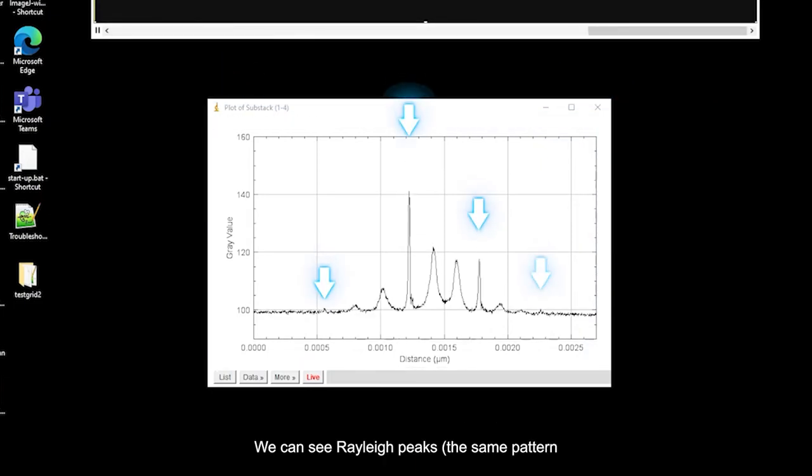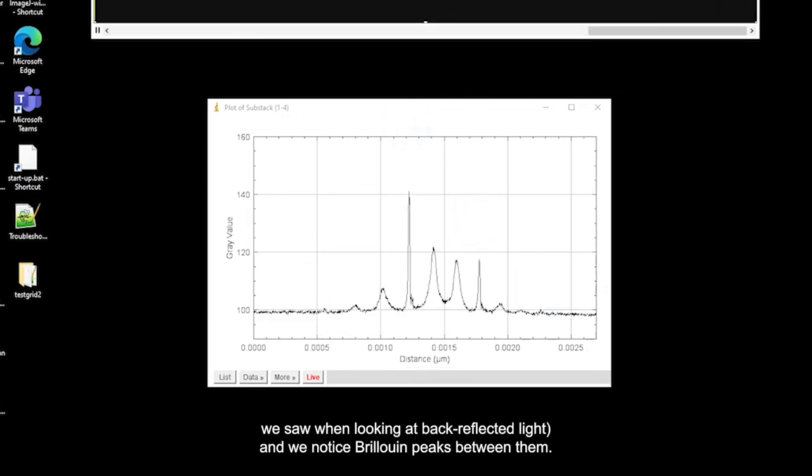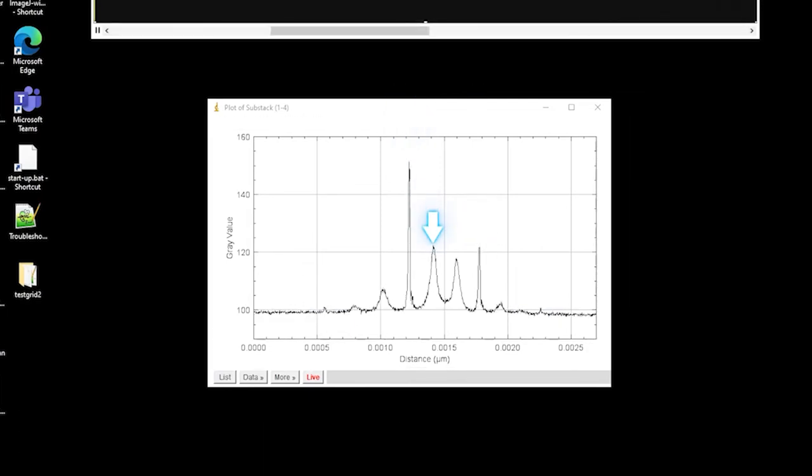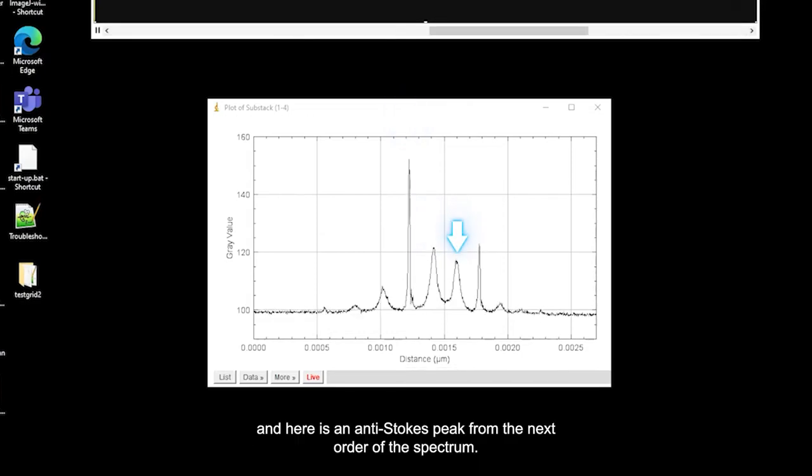We can see Rayleigh peaks, the same pattern we saw when looking at back-reflected light, and we notice Brillouin peaks between them. This peak is a Stokes peak, belonging to the same order of spectrum as this Rayleigh peak, and here is an anti-Stokes peak from the next order of the spectrum.